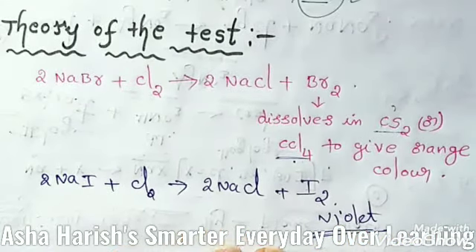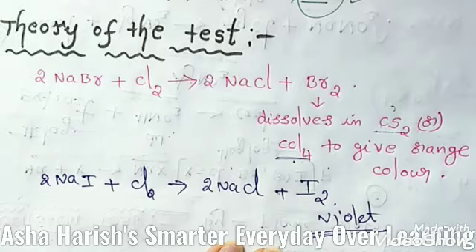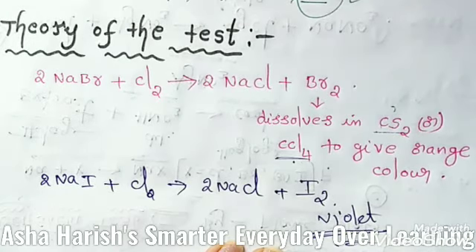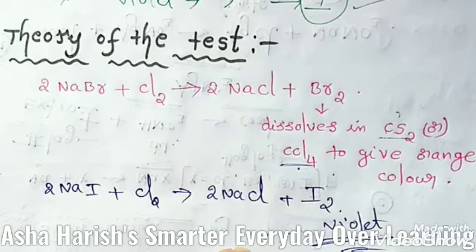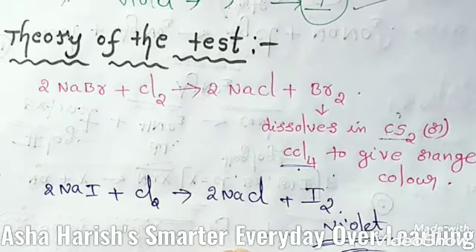This is the theory of the carbon disulphide test. Okay students, this is about today's session, how to detect the halogens present in the organic compound we have taken.